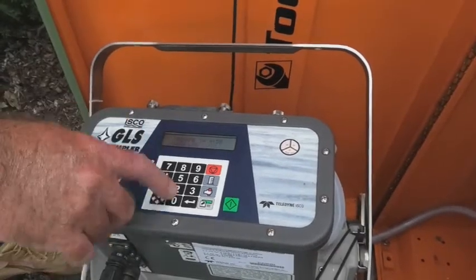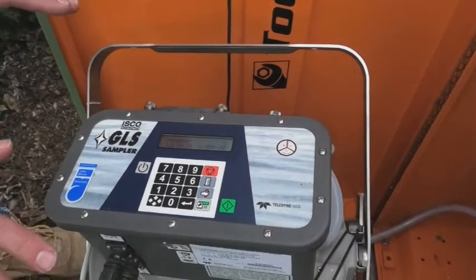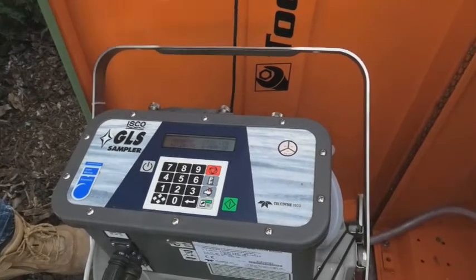You want to scroll across to HALT and just hit enter. So that actually puts it into standby now, so you can do pretty much whatever you want with the sampler without it actually getting triggered by the logger.